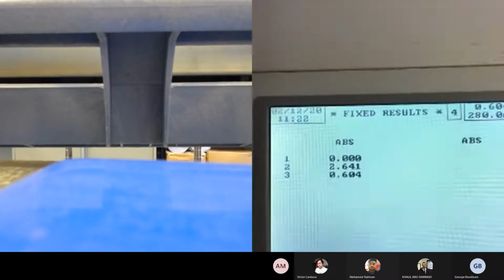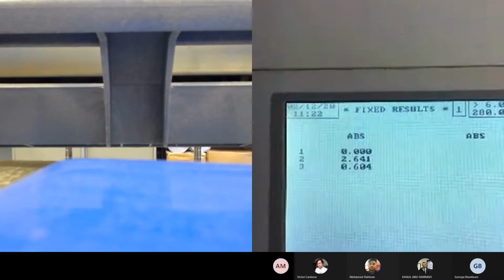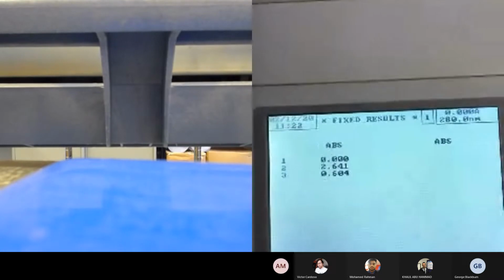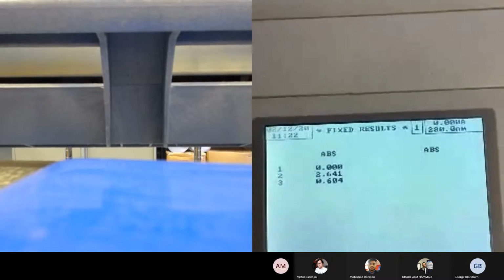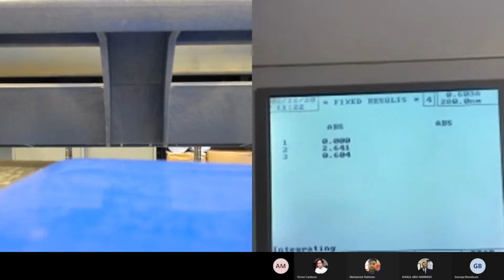Yeah, just to lower the camera a bit, Thomas. Yeah, we've got 604. So what you've done, Thomas, is you've done 3 solutions in separate cuvettes, so we'll have 3 values, so we can find an average, so it should be hopefully more accurate than just taking 1 reading. Absolutely. That just also checks that you haven't made any errors, basically, so if you can do it 3 times, that's great.